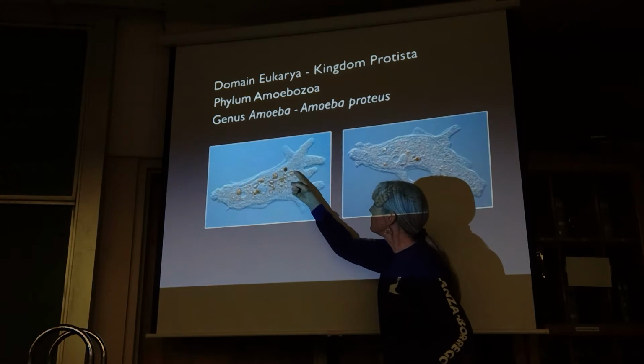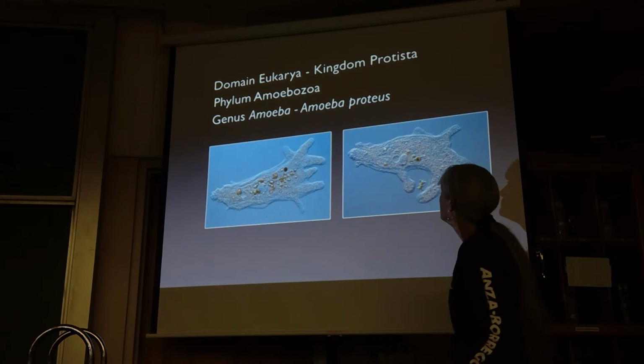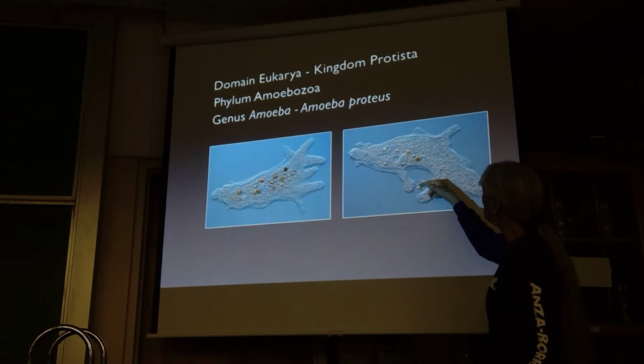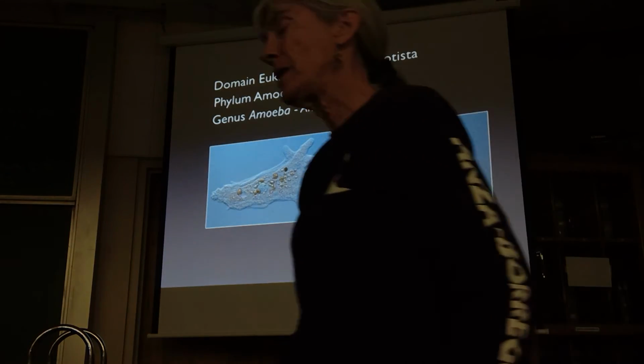This thing has been eating a variety of materials. There's the nucleus. Here's a contractile vacuole. Here, this is the nucleus. This is the contractile vacuole. This is forming a food vacuole. It's getting ready to eat that little gob of algae.